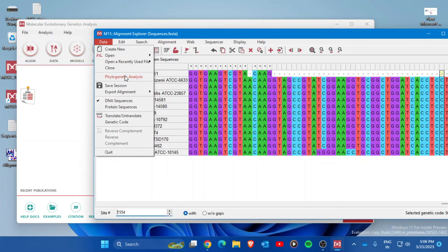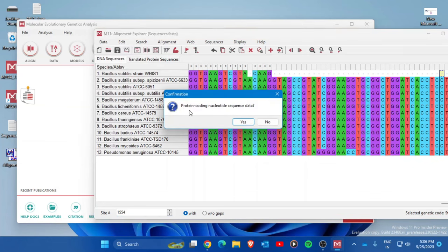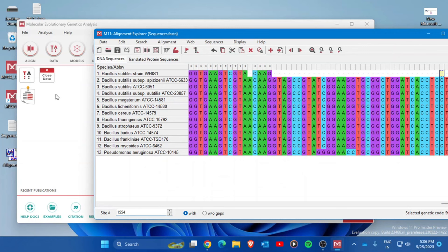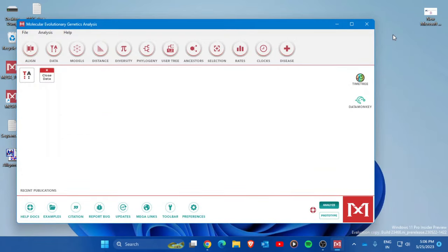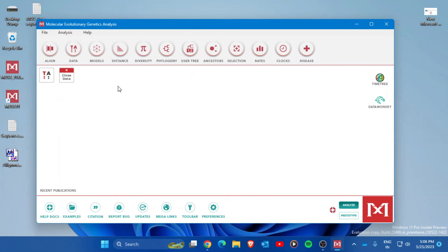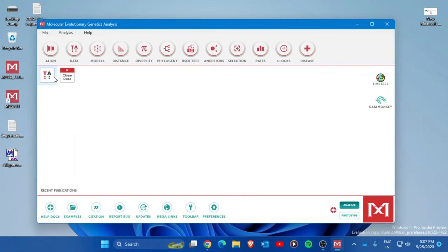Press on Phylogenetic Analysis. It will ask whether this is protein-coding nucleotide sequence data — press No. Once the task is complete, you will see the new file appear on the MEGA main interface. You can then close the alignment window. Your multiple sequence alignment data is now saved and visible on the MEGA interface.